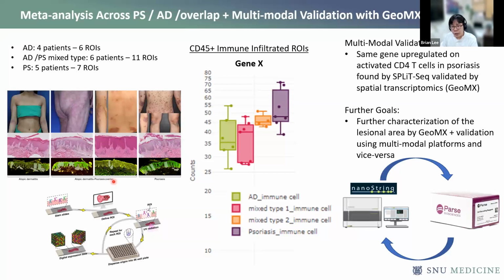And so we wanted to understand, is this just at the phenotypic level, just looking at the skin, or can we see that recapitulated within the actual transcriptomic and gene levels? Is there overlap between gene expression data? Are there common features between these diseases?